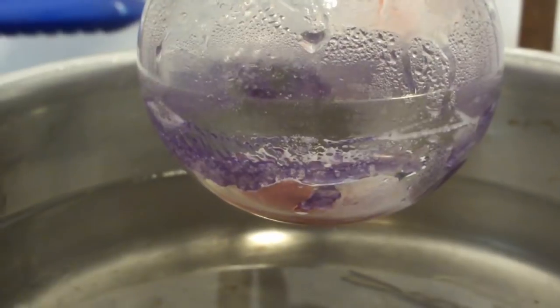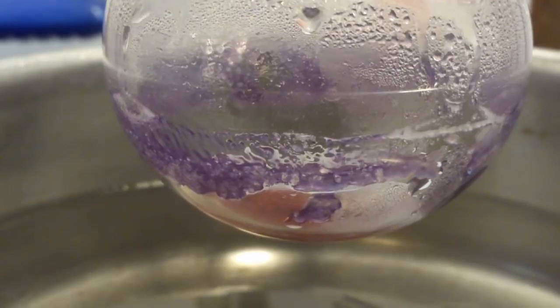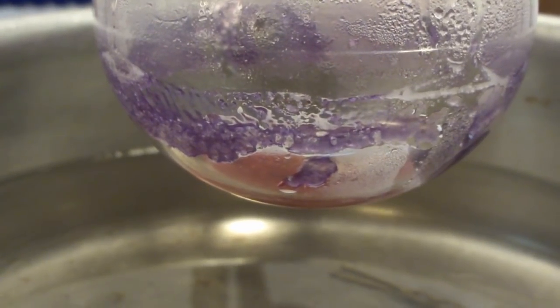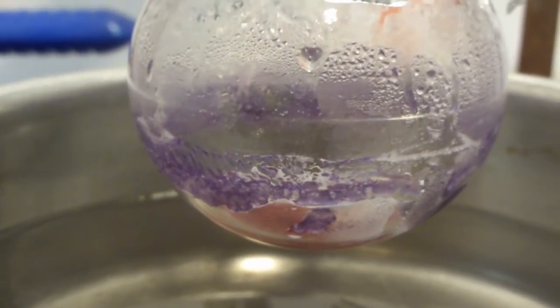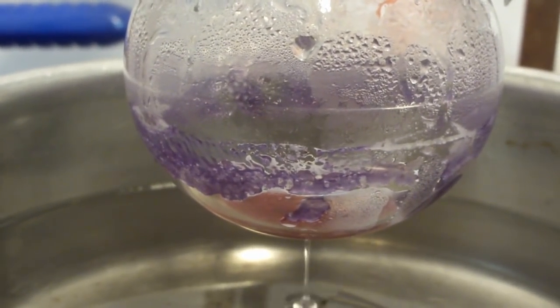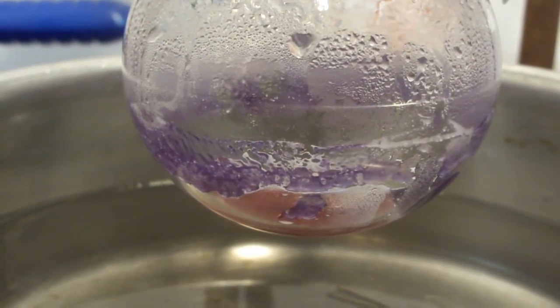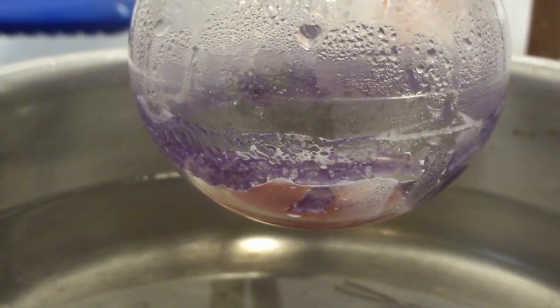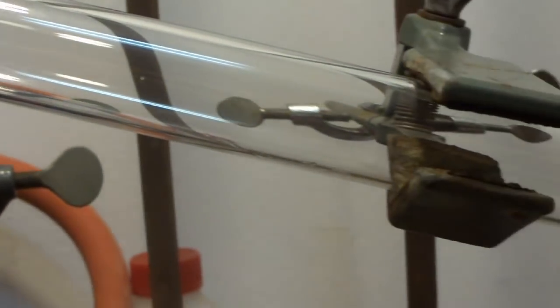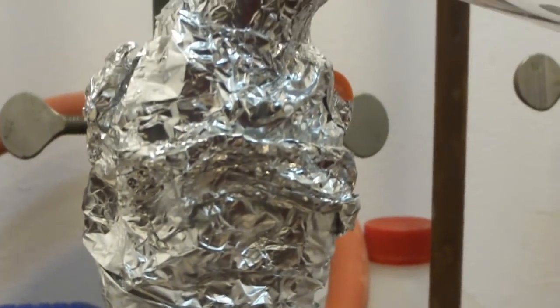So this is the residue in the boiling flask. So I wouldn't worry too much about the residual trioxane in this flask, since you can just add another batch of trioxane to this flask and distill it out of the exact flask. Now the only thing left is to melt any residual trioxane out of the condenser, which I've already done, and let the apparatus cool down.